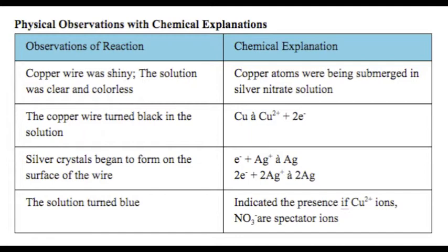Next, the solution turned blue, and this indicated the presence of Cu2+ ions and that NO3- or nitrate ions are spectator ions.